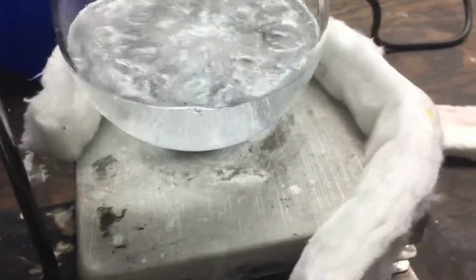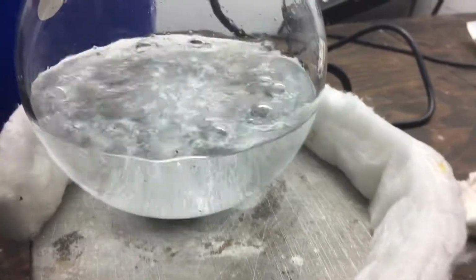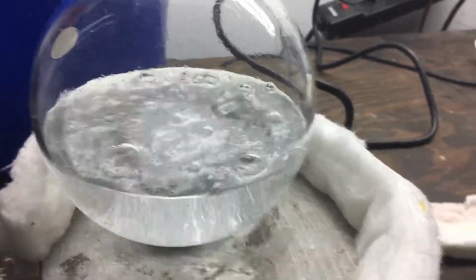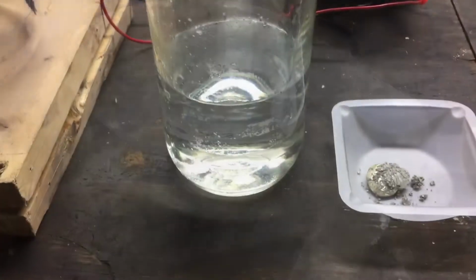So it's been a few hours, and the grand majority of the tin is dissolved. I think this represents within the range of 2 to 5 grams of undissolved tin. So there's probably about 50 grams in total. And as you can see on the glass, on the side there, there's some speckling, and those mostly are insoluble impurities, which I will remove when I cool the solution and filter it off. And while that's cooling, I'm going to set up the cell for electrolysis.